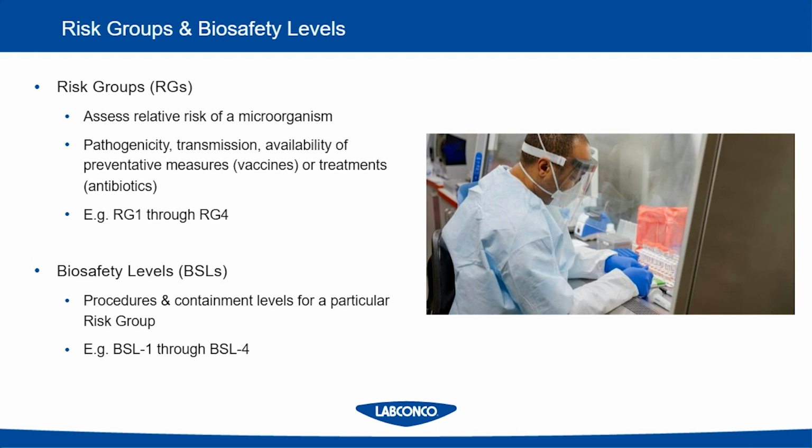One of the questions we frequently get asked is what kind of cabinet or what kind of enclosure do I need for a BSL 2 lab or for a BSL 4 lab? This is really something, again, you have to work with your biosafety officer on and then go back to those resource guides to look at what they recommend. In general, the difference between BSL 1, 2, 3, and 4 labs is not only that a biosafety cabinet may or may not be required, but also, do you need signage on your doors? Do you have to have a locking door?